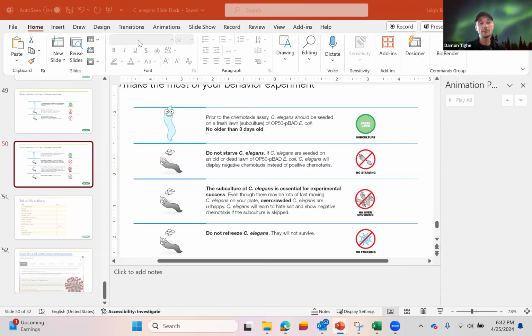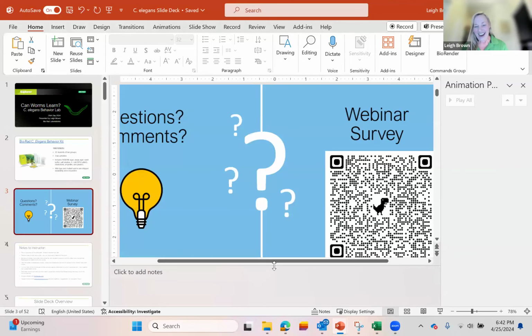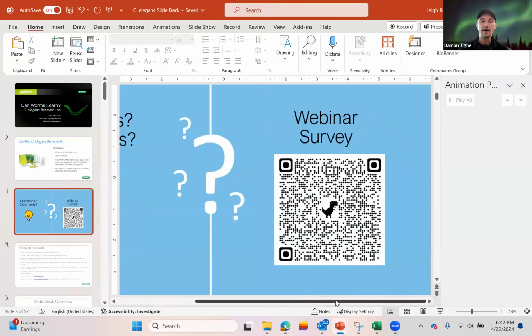It's interesting because people have used worms in really wild chemotaxis. There was a research group in Japan that was taking urine from patients, and they found an association where the worms liked the urine from patients with cancers. They were using it almost as an assay to determine, I forget which cancer it was, but I was kind of like, who even came up with that? Like, hey, this is what I want to run as my experiment. But even just this simple idea of being able to do a chemotaxis, because these are very sensitive organisms to picking up molecules, there's just a lot of ways you could take this.